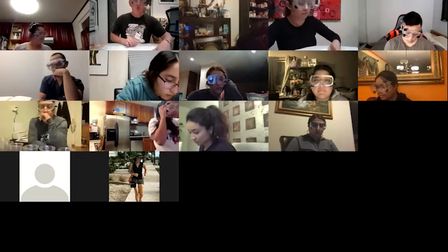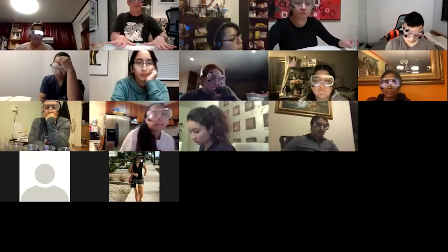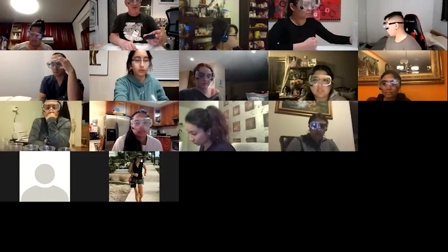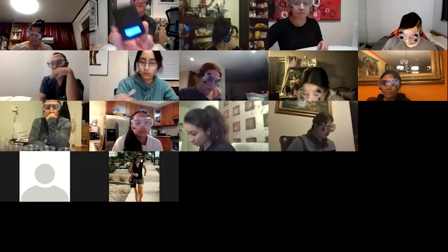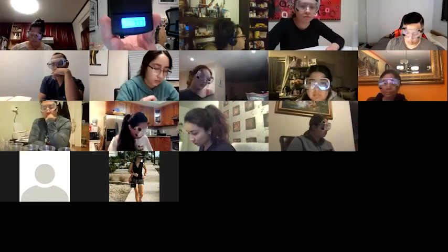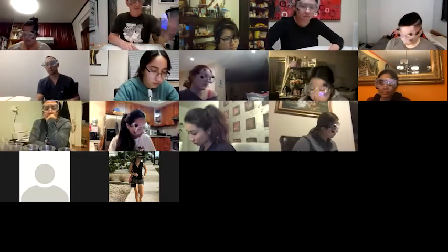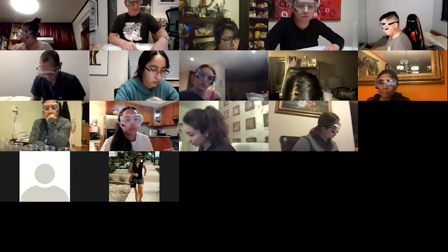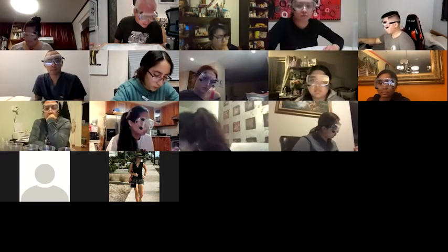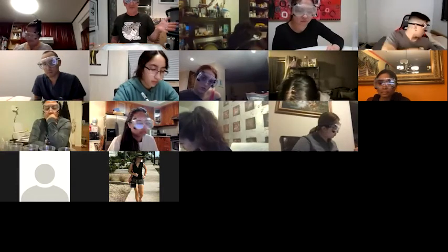It's also super important to have a flat surface. It's got to be flat. As you can see, it says 0 when I have it on a flat surface. And the minute I pick it up, it starts giving me all kinds of weird numbers, right? It's just jumping all over the place. So it needs to be flat. And when you make a measurement, if you just blow on it, you'll see it makes a big change.